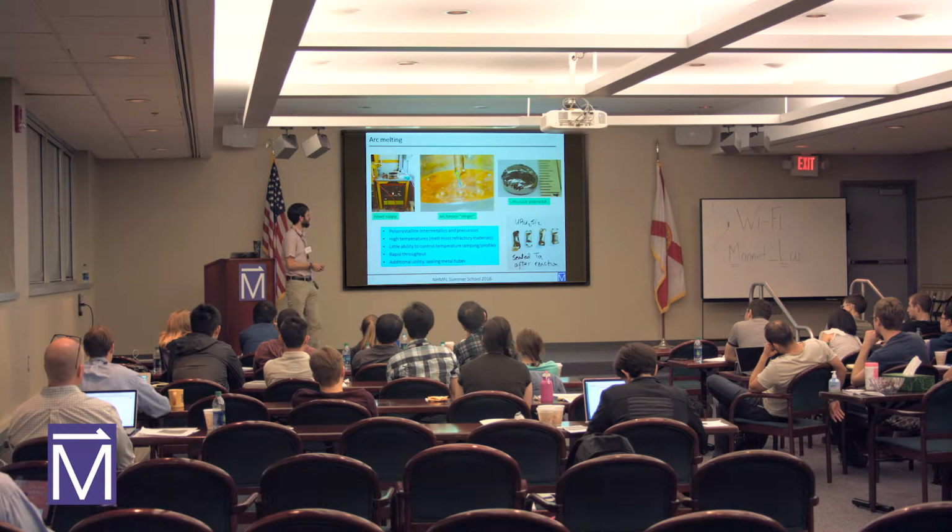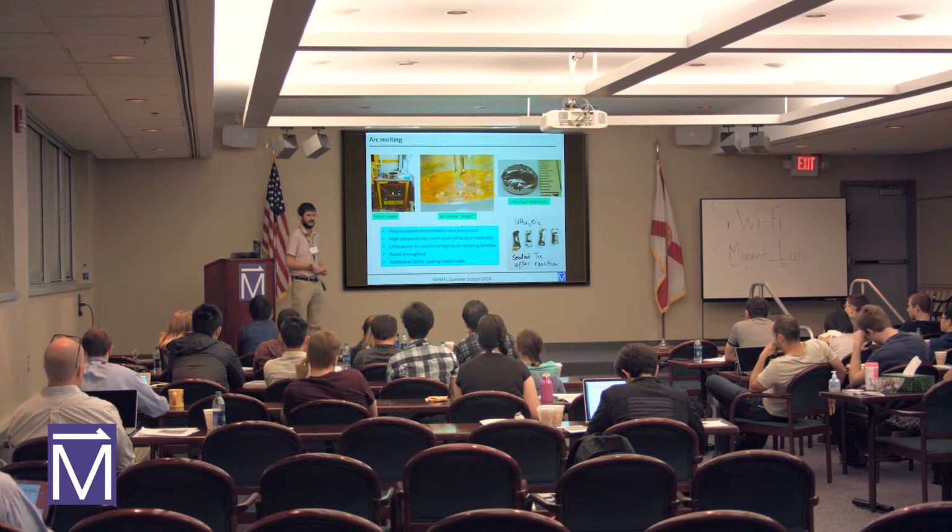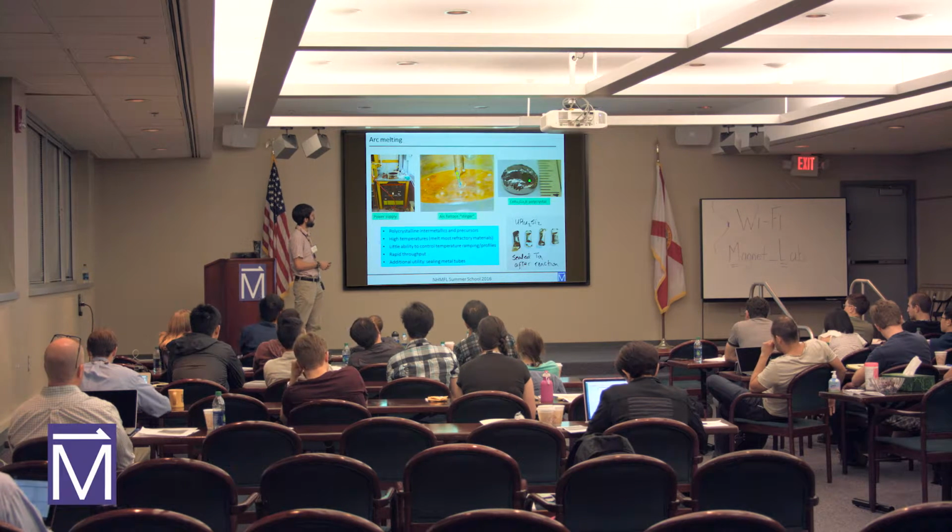So what you can do if you want to grow something like this is to first put the cerium and boron next to each other, and then melt the cerium from the side and let the boron sort of bleed into it. And that's a good way to handle materials like that. And then you just come along and combine it with ruthenium and gallium. And you can see that it actually produces a really beautiful crystal. And here, you can even see that there are facets.